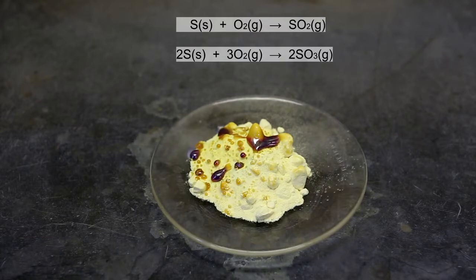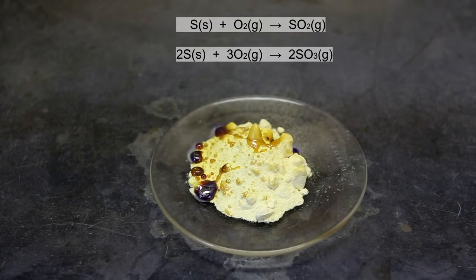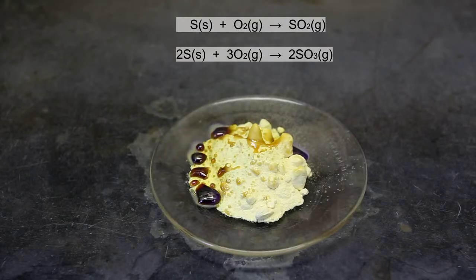The melting point of sulfur is quite low at only about 115 degrees Celsius. The heat of the combustion of the sulfur is able to keep the sulfur in its liquid state. As the sulfur burns, more and more of the solid sulfur is melted and converted into its liquid state.